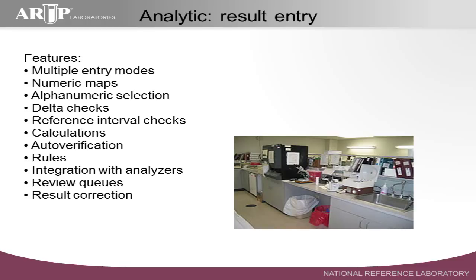And many other things. And result correction. I know none of you ever make mistakes, and we don't enter results incorrectly. But in case you do, there is an error correction feature in all LISs today.